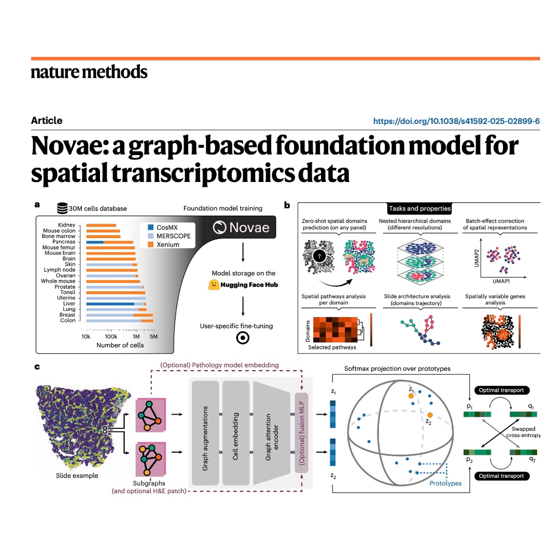Existing tools just can't handle this scale and this diversity robustly. They just can't. So our mission today is to introduce you to Novae. This is a graph-based foundation model, and it's designed specifically to solve this massive data integration headache. It was trained on that monumental 30 million cell data set to be a versatile zero-shot tool. Its core promise, really, is eliminating the computational bottlenecks of older analysis methods by handling these experimental variations, these batch effects, natively and at incredible speed.